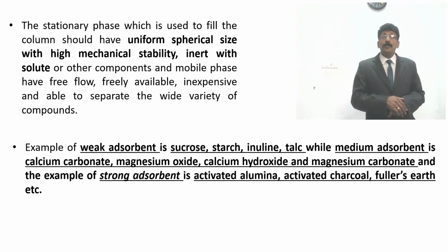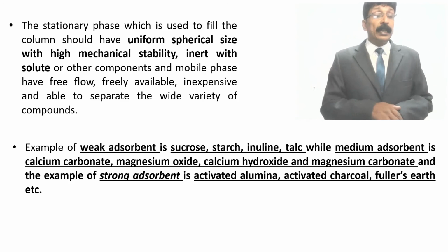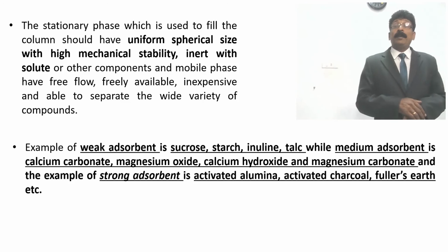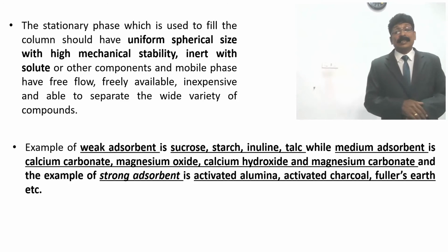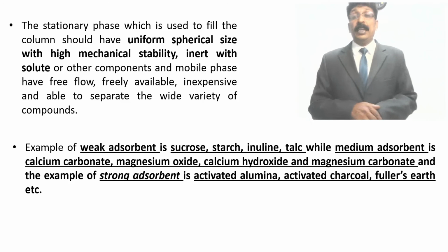So when you talk about activated, I hope the students understand that activated means the unwanted moisture which may be present in adsorbing materials like alumina and charcoal has to be removed. Only then can it act as a very good adsorbent for the separation of compounds in chromatography. That's why we use the word activated.